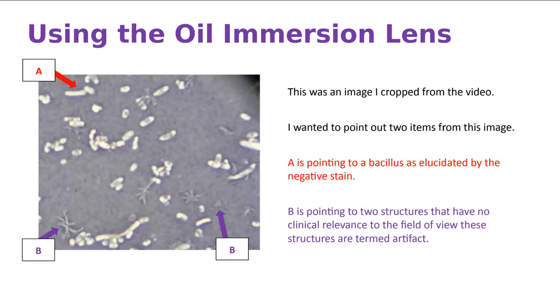Can somebody tell me the morphology? What is the morphology? Shaped, right? What is it? It's a bacillus. That's correct. Rod-like. It's a bacillus. It's a rod. That's correct. Very good. Now, the other two things are looking at artifact.